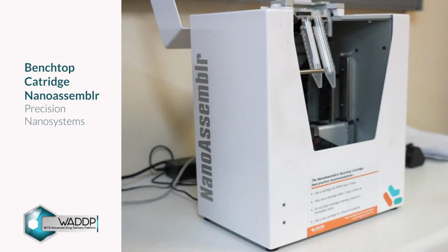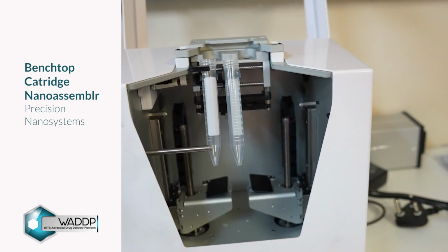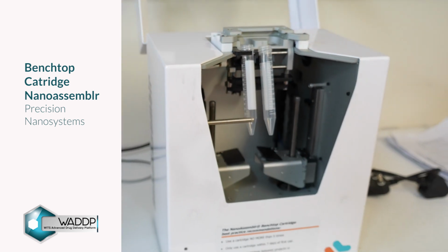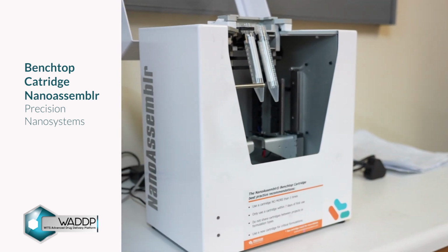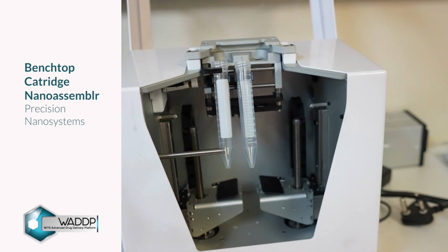It enables rapid formulation of nanoparticles, for example, lipid nanoparticles, polymeric nanoparticles, and hybrid nanoparticles, by mixing components at very small scales using microfluidic cartridges.